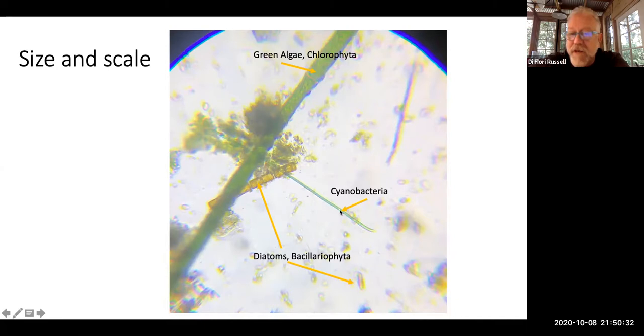So now you can imagine those bacteria, which were much smaller, you probably couldn't even make out except maybe as the smallest dots at this magnification on a microscope slide. So be aware that there are different scales of things going on. And although you may see pictures that all look the same size, these organisms are not.